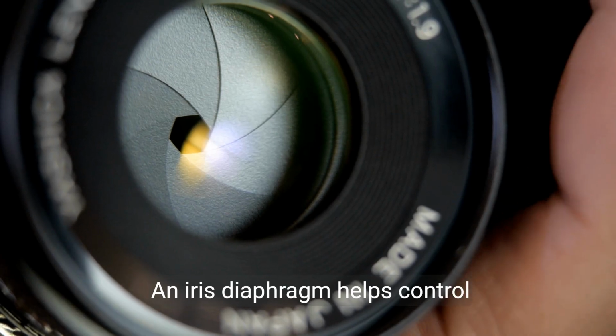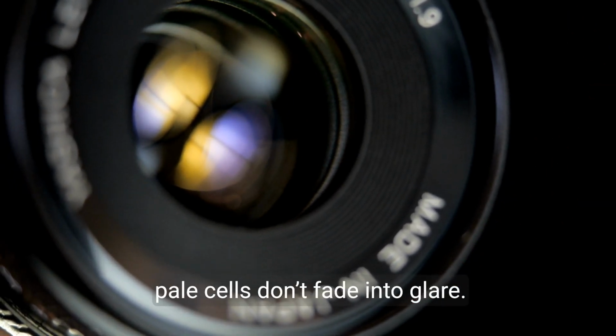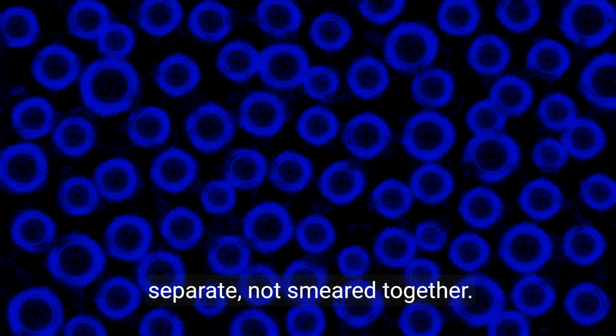An iris diaphragm helps control how much light comes through, so pale cells don't fade into glare. Scientists also talk about resolution, meaning how close 2 points can be and still look separate, not smeared together.